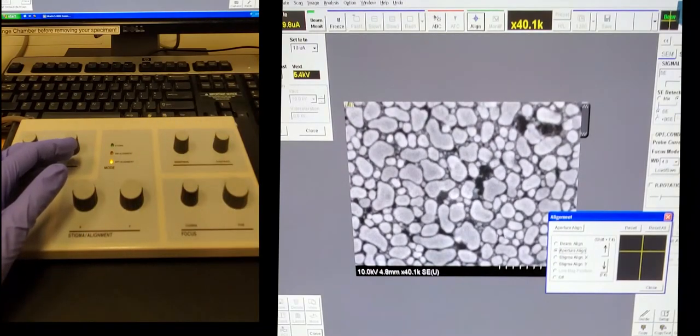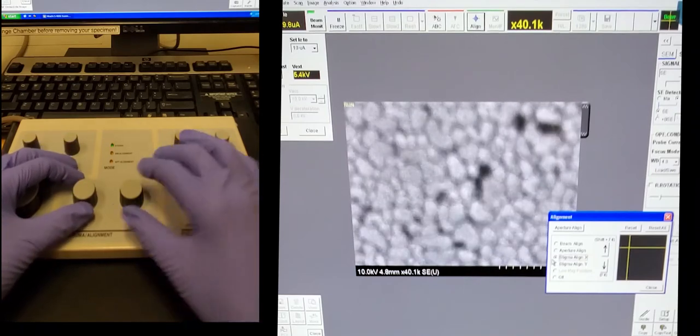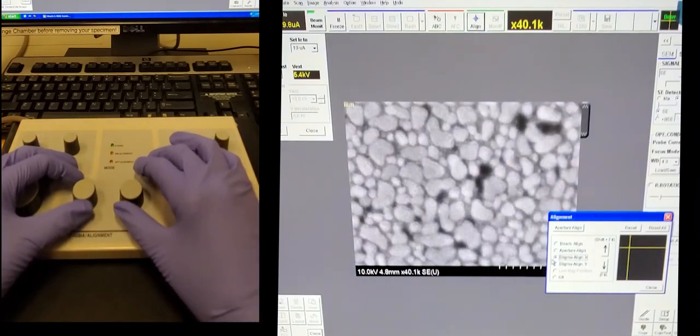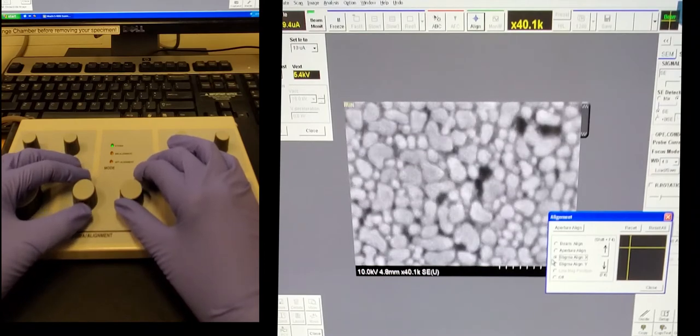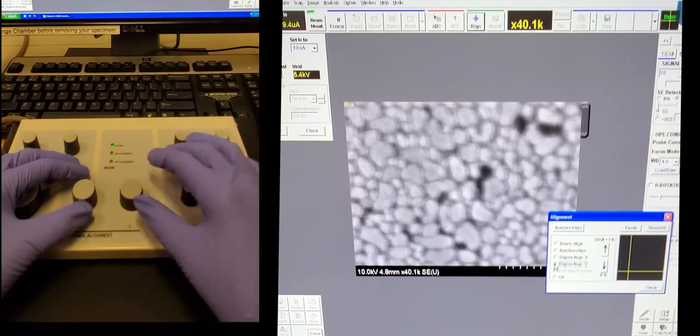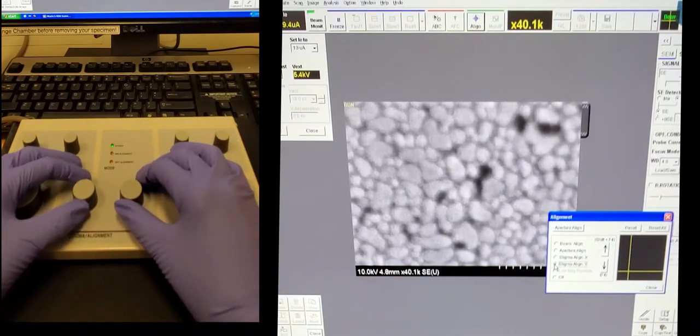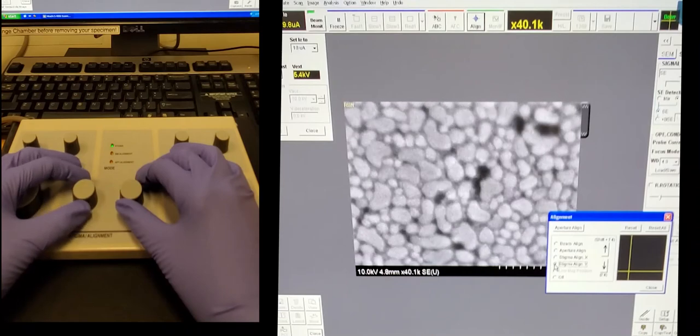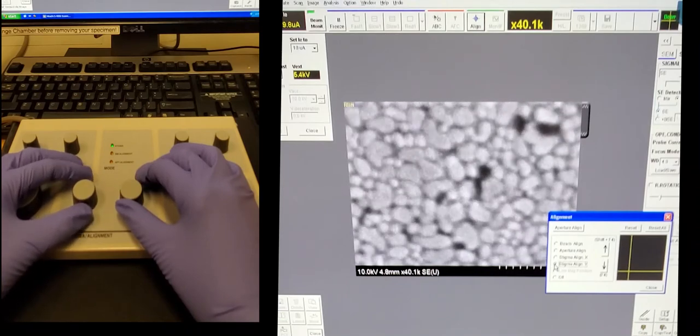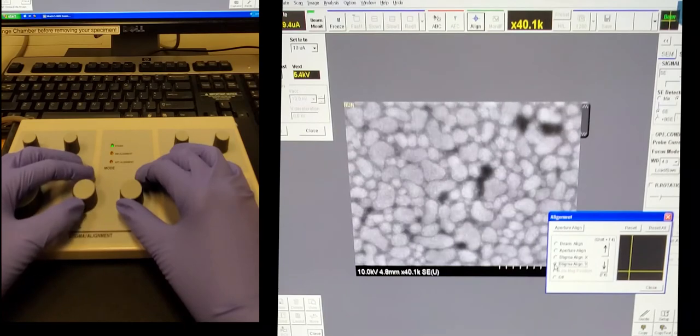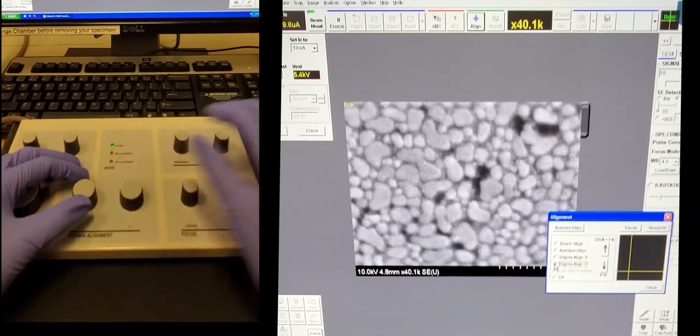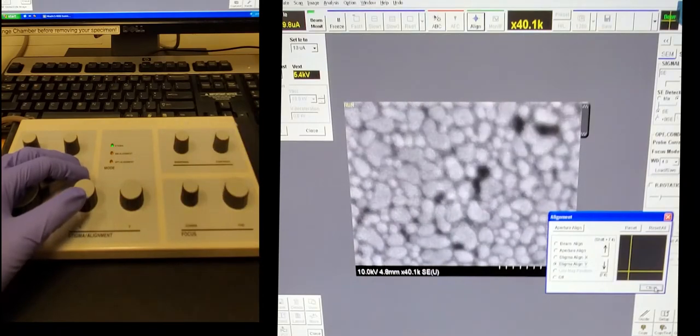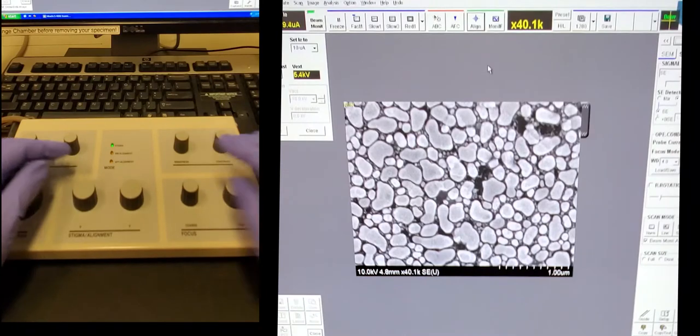So this looks good. Check the others. And they're actually not so bad. A really bad case it would be jerking all over the screen and that would be where you need to make major adjustments. Here the adjustments are only minor. So alignment done.